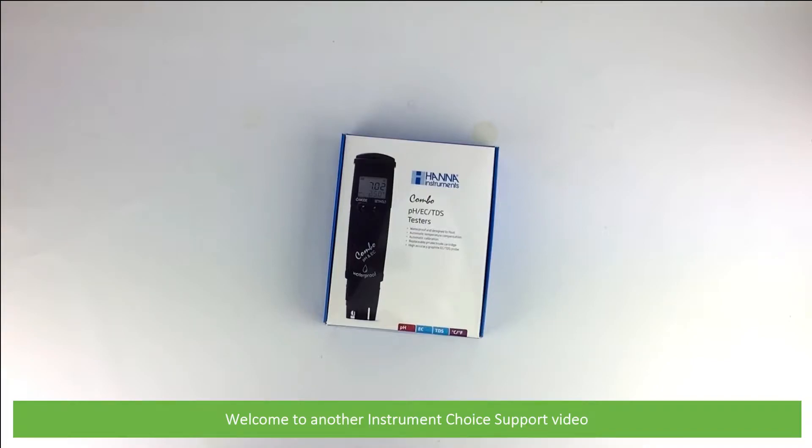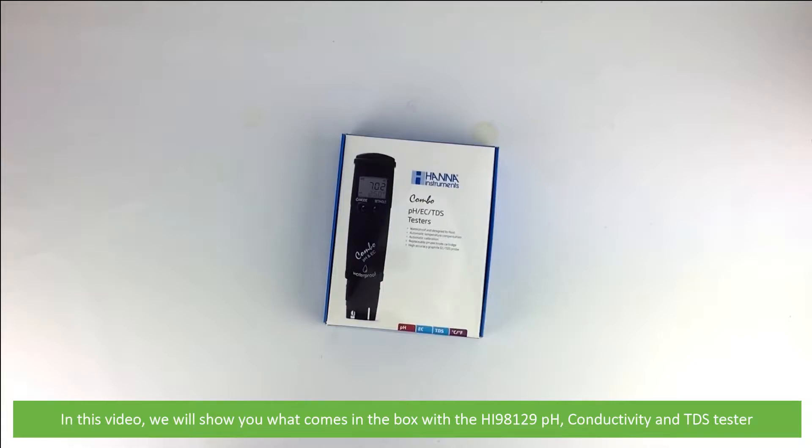Hi and welcome to another Instrument Choice support video. In this video we'll show you what comes in the box with the HI-98129 pH, conductivity and TDS tester.